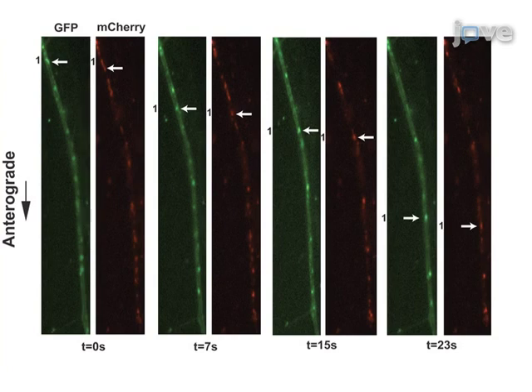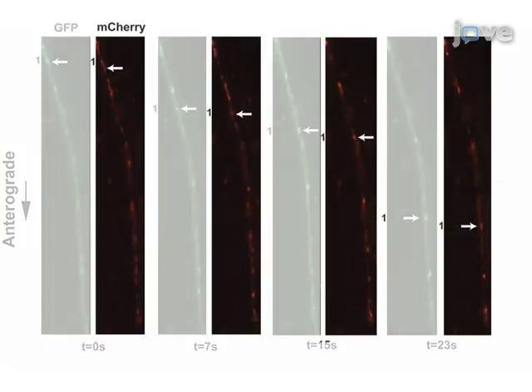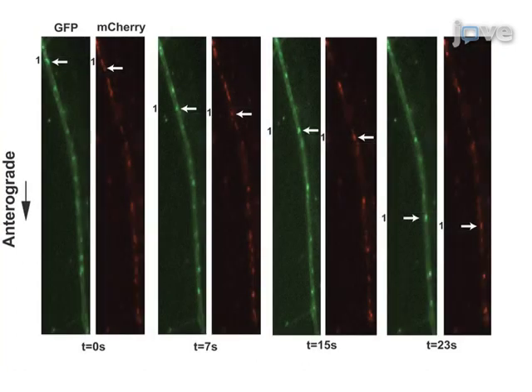In this figure, representative live cell imaging of SCG axons at 8 hours post-infection with PRV348 is demonstrated. Anterograde transporting structures within distal axons are visualized in two fluorescent channels, GFP and M-cherry. An anterograde transporting structure, as indicated by the white arrows, progresses within the axon.